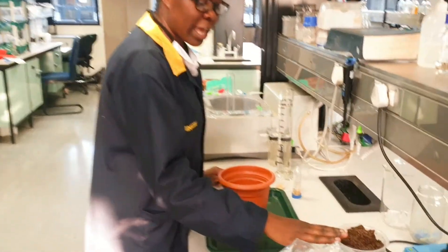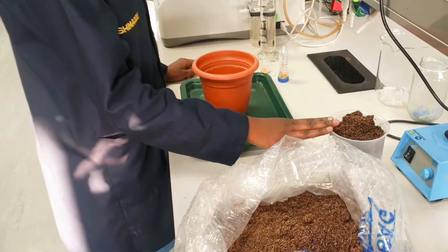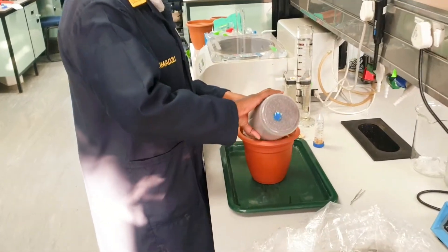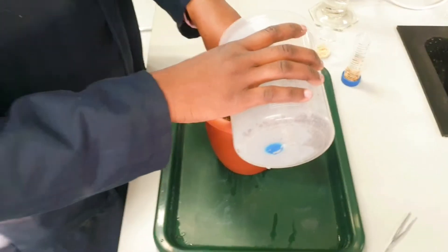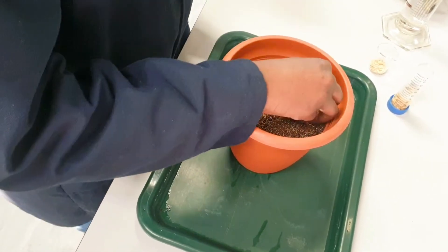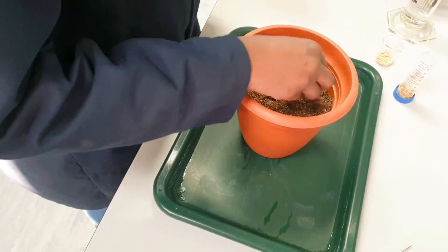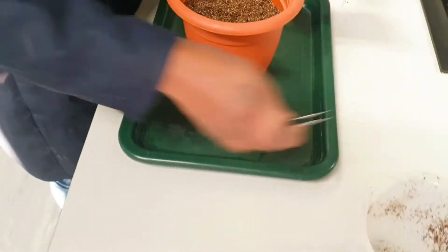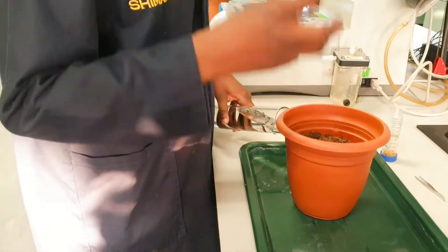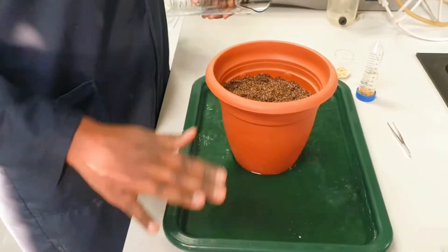Here we have our soil, which was pasteurized at 70 degrees. We start by putting the soil into the pots, trying to keep it even, before putting the seeds in. I put the water in first — I want the soil to start absorbing the water — so I use autoclave water.